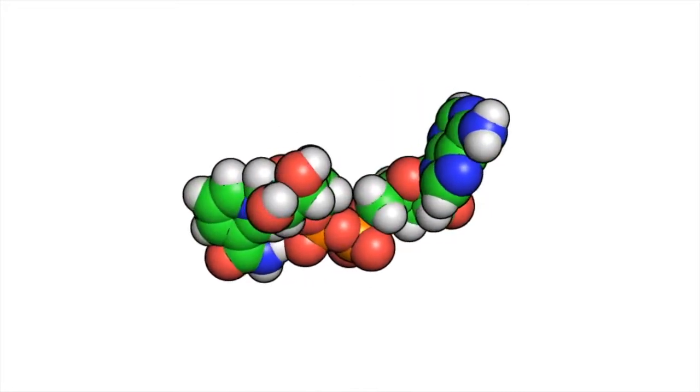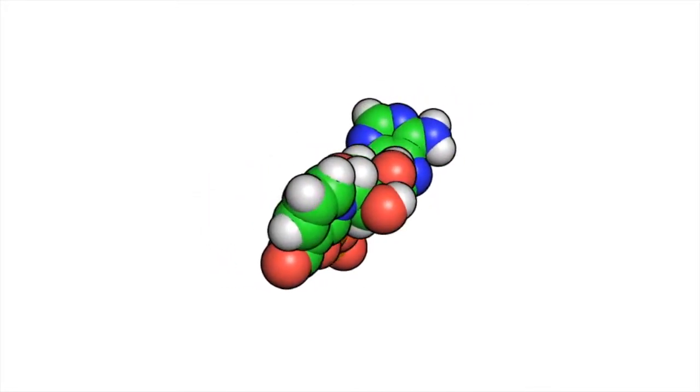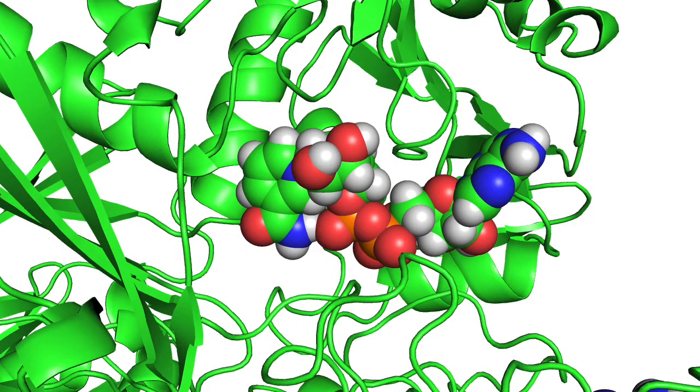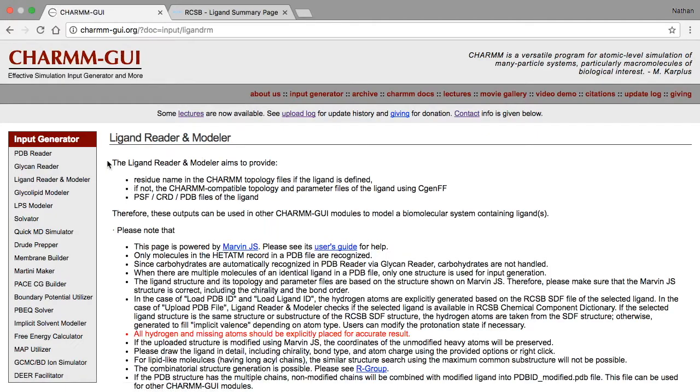Here's an animation of an NAD molecule. And here it is with the rest of the protein.